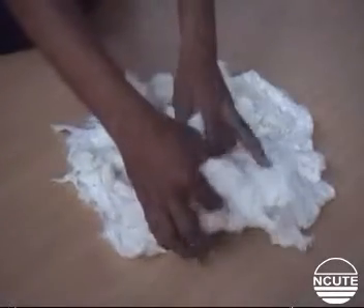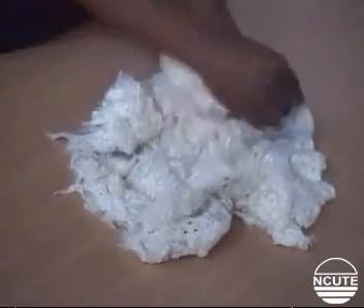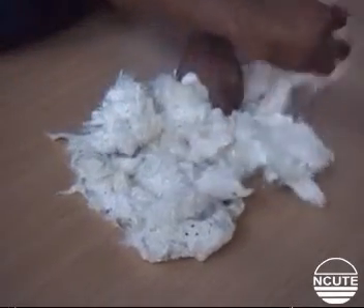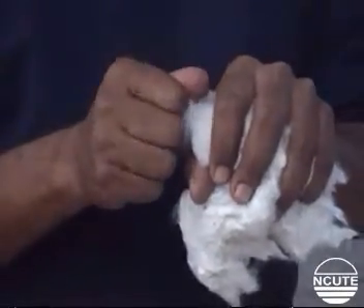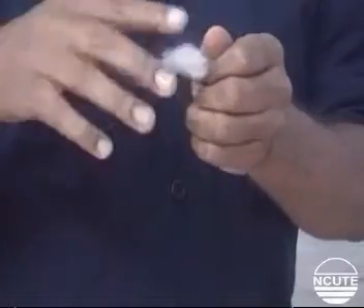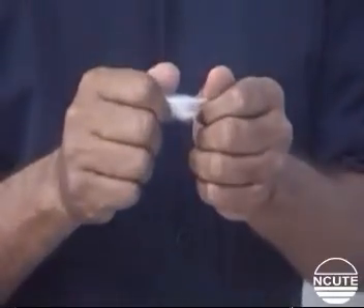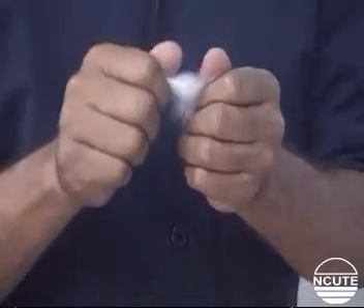To perform a test, first take a representative tuft of cotton from the bulk or given sample. Then mix the fibers well using the four fingers and thumbs of both hands as demonstrated.